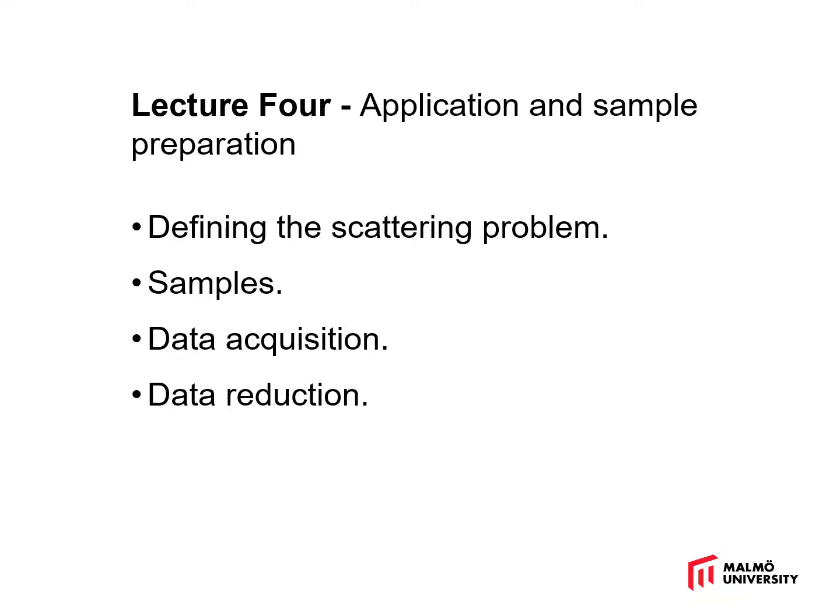I'll talk about data acquisition and the reduction of data, a term very specific to small angle scattering, into an absolute intensity scaled scattering cross-section, or the probability of an X-ray or neutron being scattered through a particular angle as a function of sample.